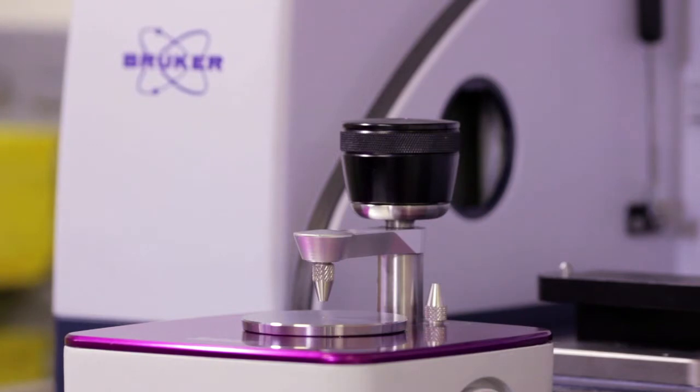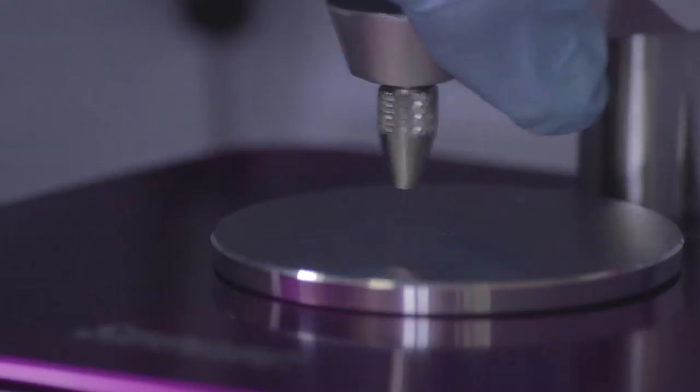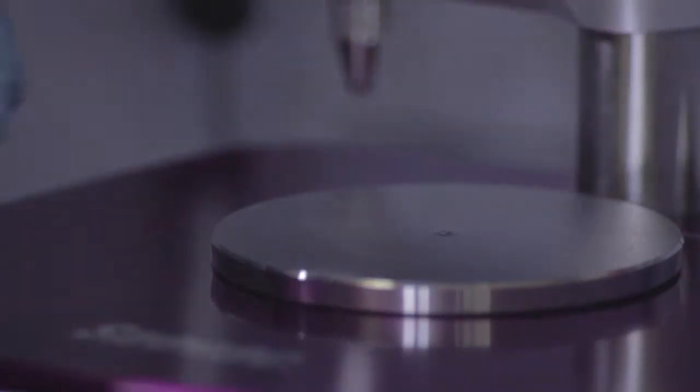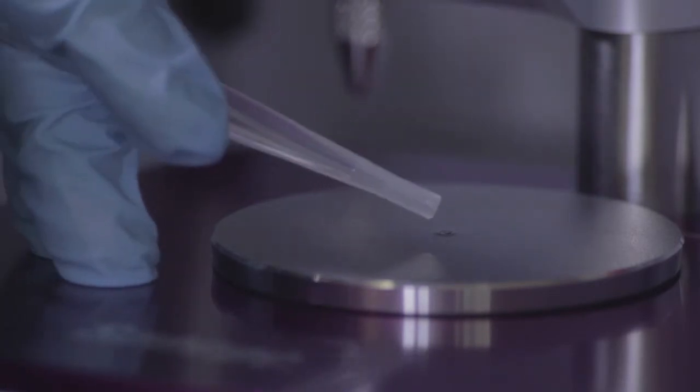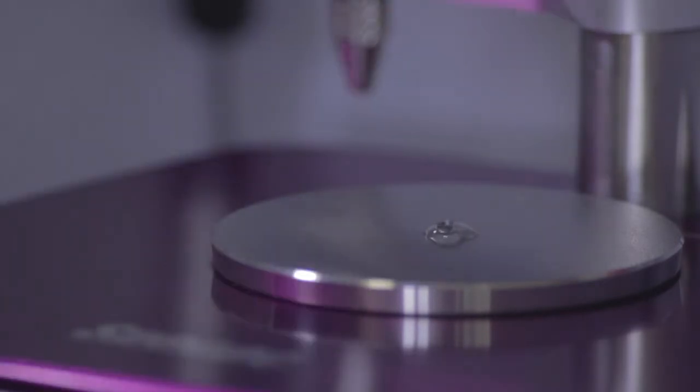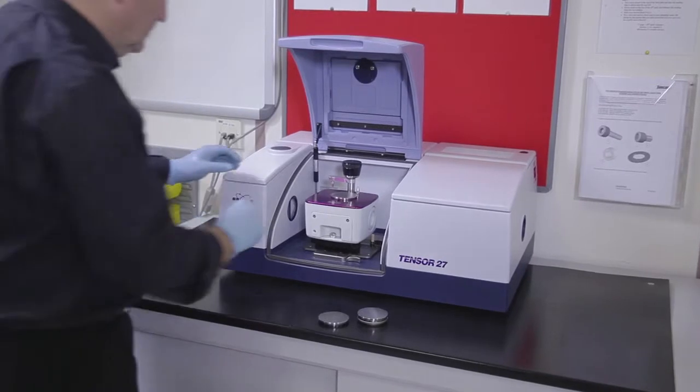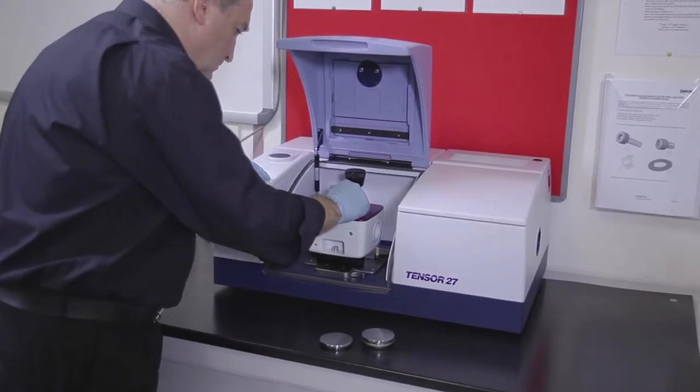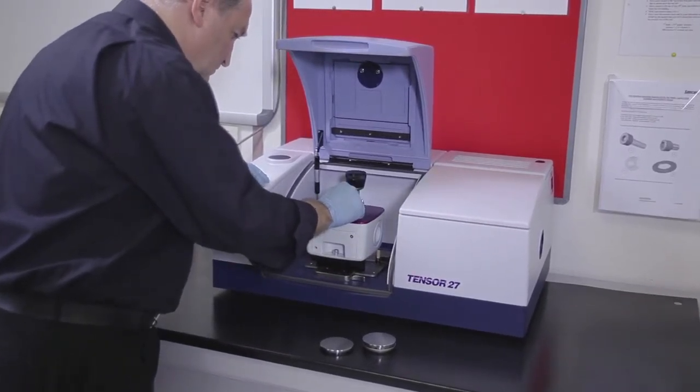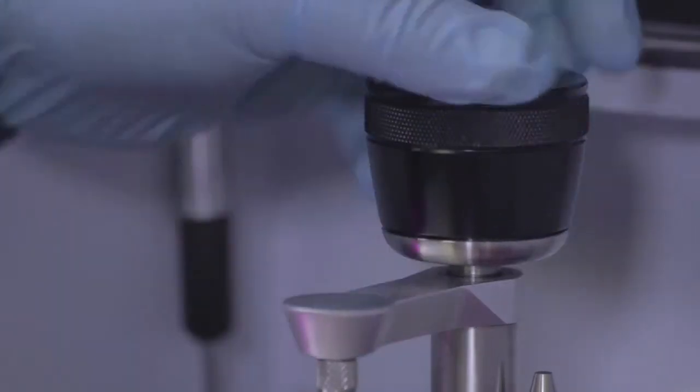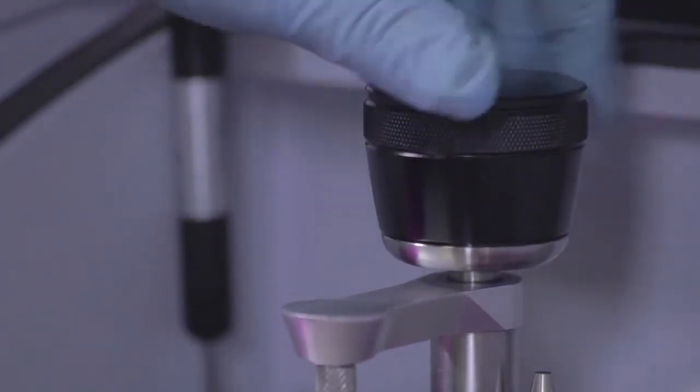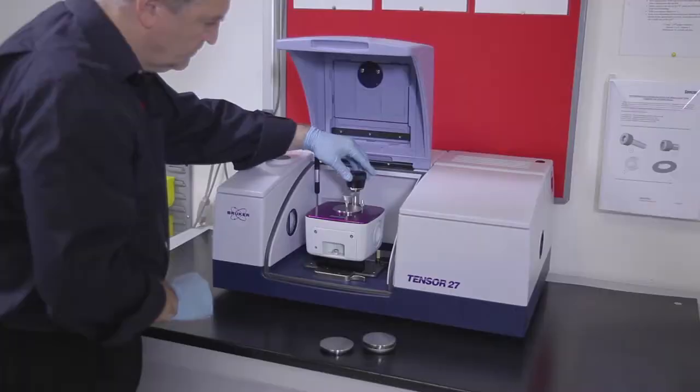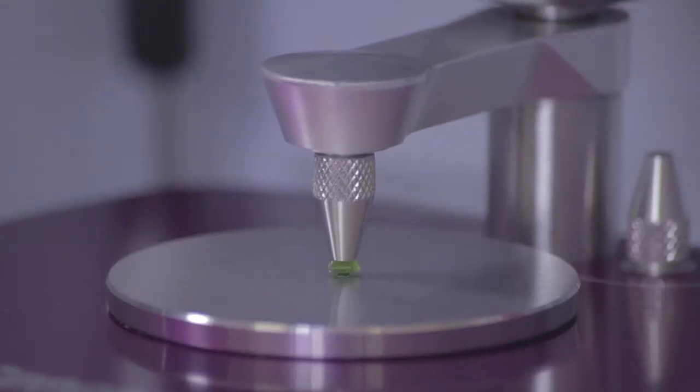The accessory is simple to use. The rotating arm assembly can be moved away to allow easy access to the top plate. Liquid samples are simply spotted onto the crystal. For solid samples, the arm assembly is turned to its sampling position and the torque screw knob turned to lower the anvil. There is an audible click when the knob has reached the preset load limit of 40 pounds.